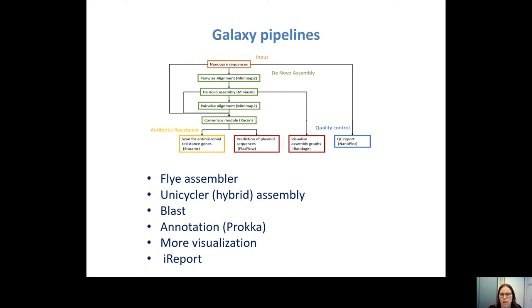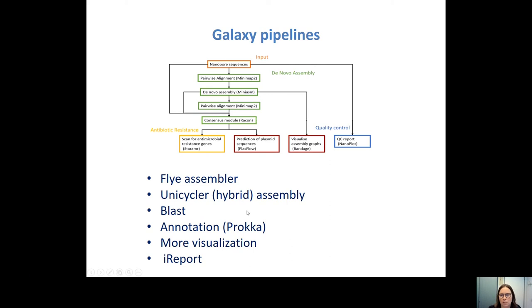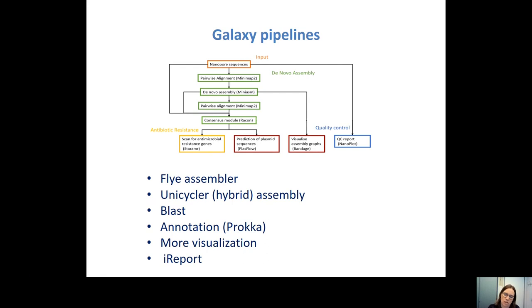We've worked to improve the pipeline over time. There's a newer assembler called Flye that works better than minimap/miniasm — we now have the same pipeline but using Flye. We also have a Unicycler assembler that polishes your DNA and can do hybrid assemblies when you have both nanopore and Illumina data, useful for getting SNP-level quality sequences. We've added BLAST, annotation with Prokka, more visualizations, and a summary in an iReport.